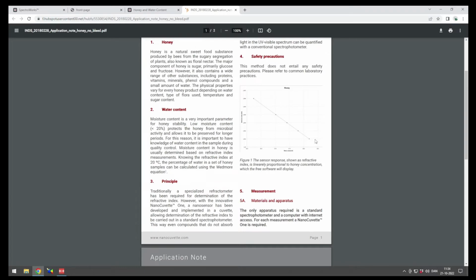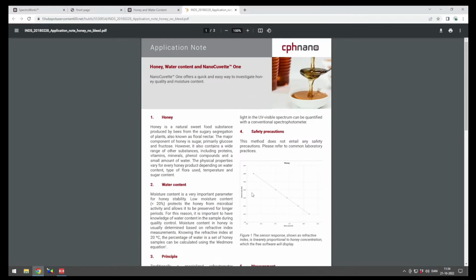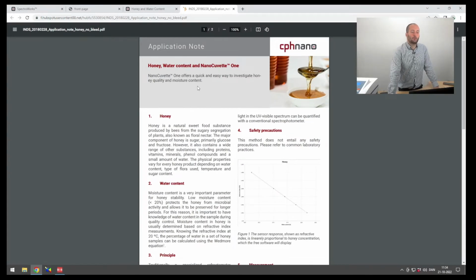It shows some of the results and a quick explanation. This is a help to you in order to figure out how to get to the results and how to use the different products as easily and comfortably as possible.